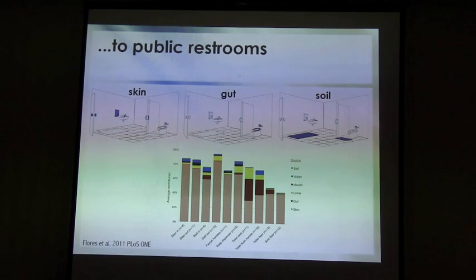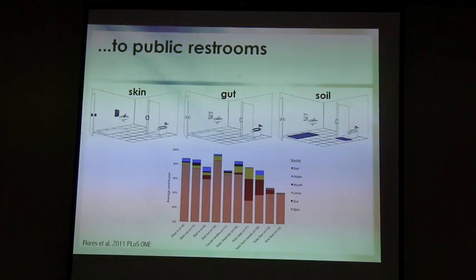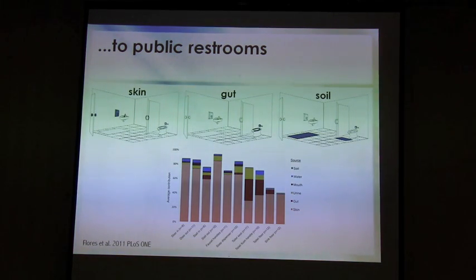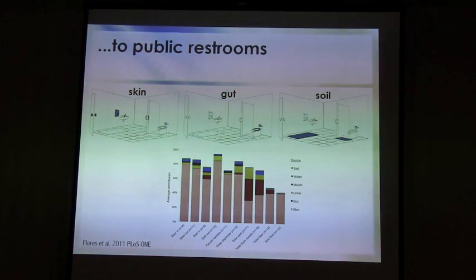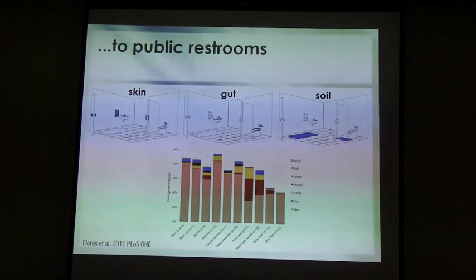For example, you saw the bathroom data early on today. Gilbert has a follow-up paper on the kitchens, where again you can use these kinds of techniques to very rapidly both assess where particular kinds of microbes are, and also what the sources of those microbes are in terms of other environments you have in the reference database.